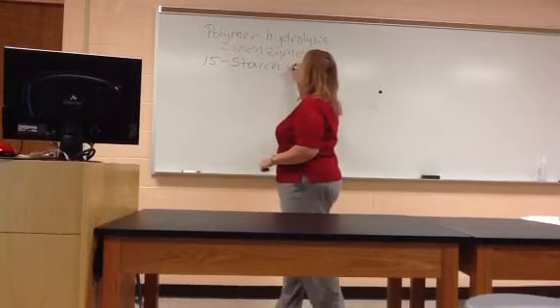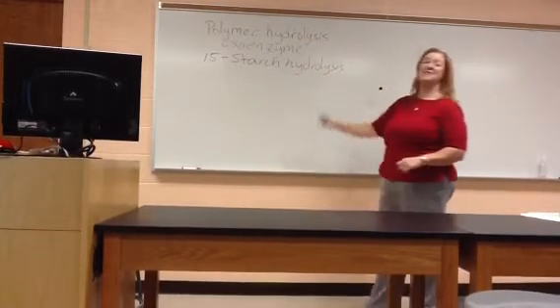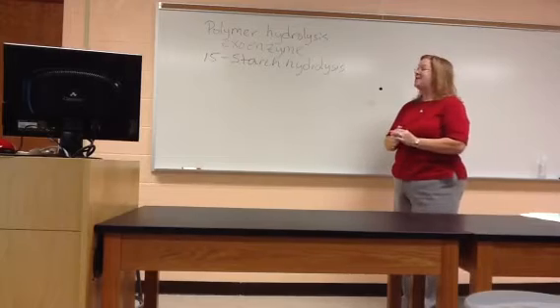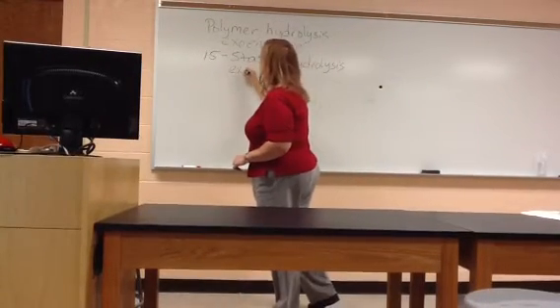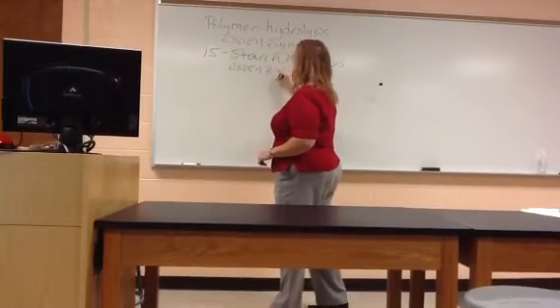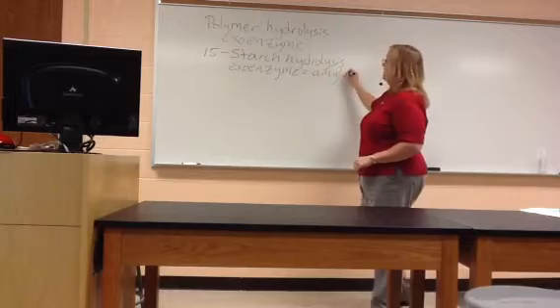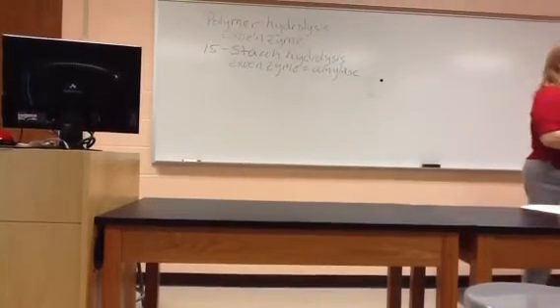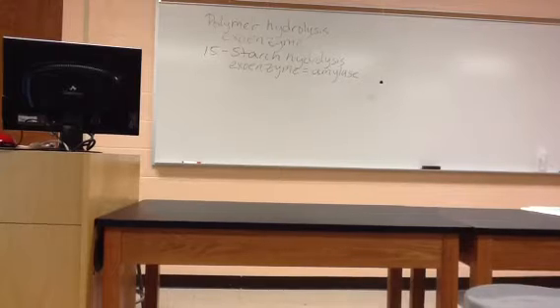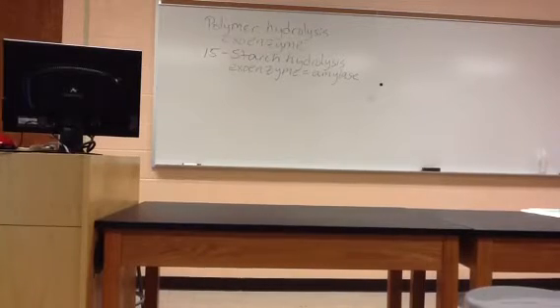So what's our polymer here? Starch, right? That's the big molecule. The exoenzyme that breaks it down is called amylase, actually the same enzyme that we use as humans to break down starch. Amylase is in our saliva. Bacteria make it too, except again, they're secreting it to the outsides of their cells.